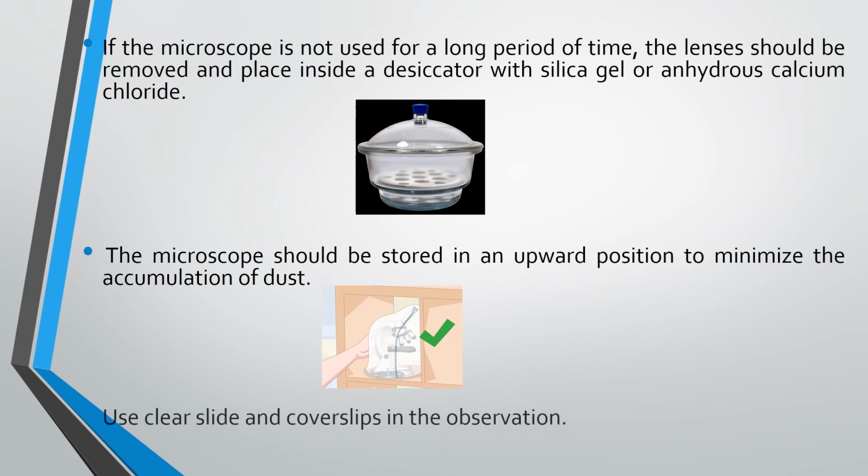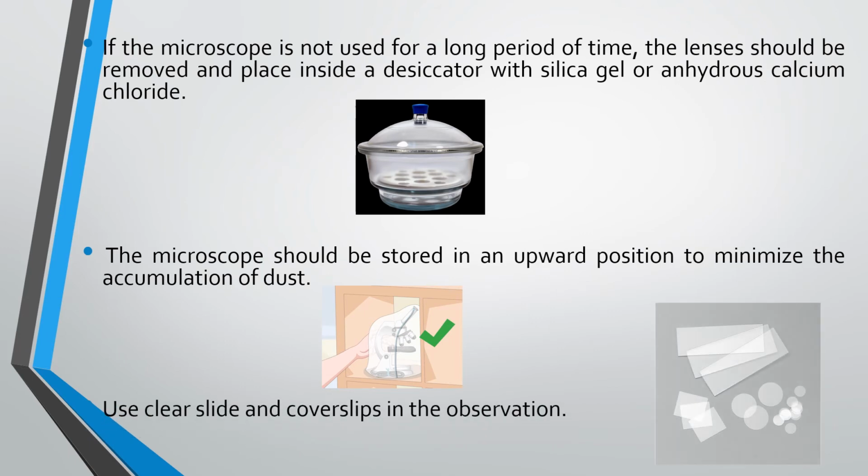And also you have to use clear and clean slides and cover slips for observing the specimen.